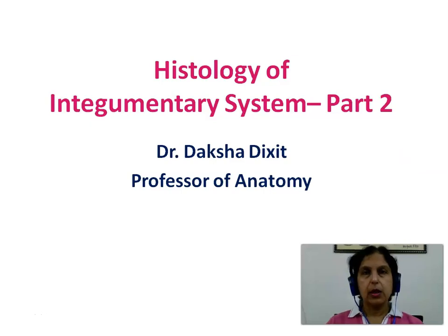Hello friends, today we will be seeing Histology of Integumentary System Part 2. In the video on Part 1, we have seen the basic structure of skin, the layers of epidermis and the parts of dermis, and we studied two important slides, thick skin and thin skin. Today we will be seeing the cells present in epidermis and the different appendages of skin.